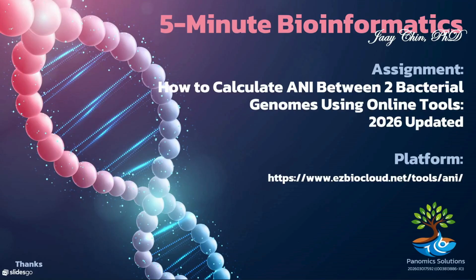1. Faster genome comparisons. 2. Reliable species-level resolution. 3. Efficient analysis even for larger datasets. Whether you're validating a newly sequenced isolate, confirming species identity, or conducting comparative genomics research, this ANI calculator provides a streamlined and accessible solution. In the next part of this video, I'll walk you step by step through how to use the platform, upload your genome files, and interpret the ANI results correctly.